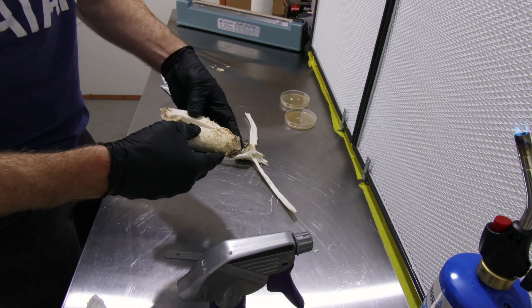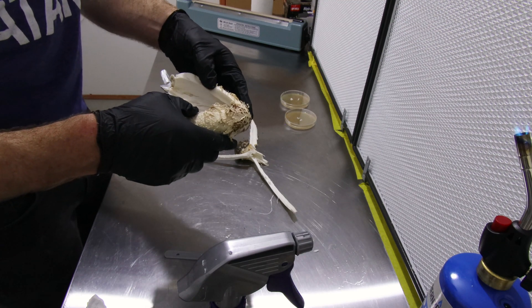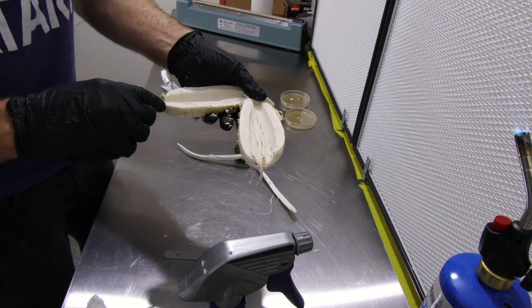You can also take a sample from up inside here, but that's quite difficult with shaggy manes because they are predominantly all gilled — almost entirely gilled with just a very thin line of the outer wall.